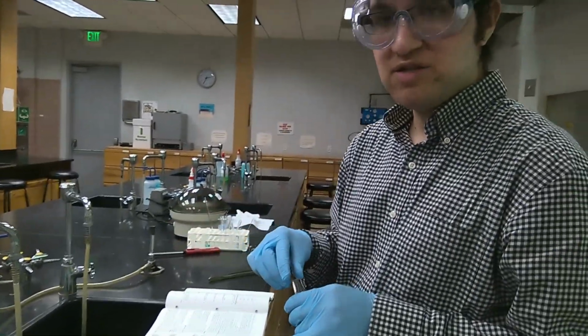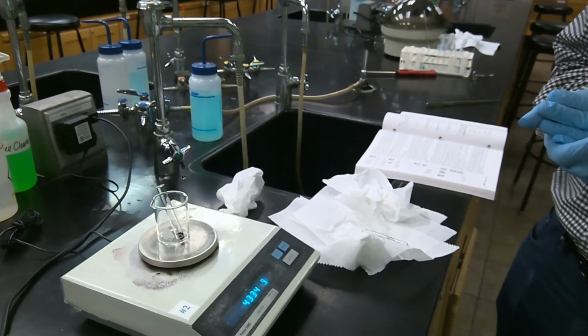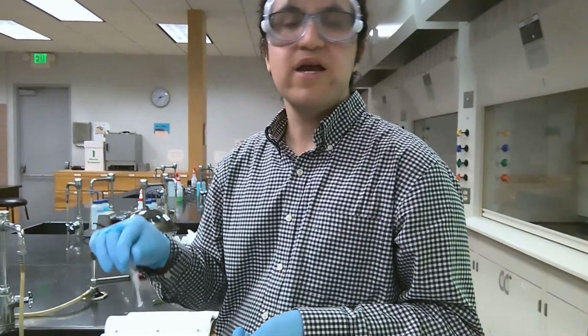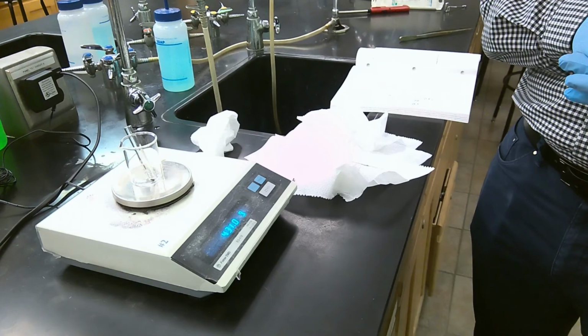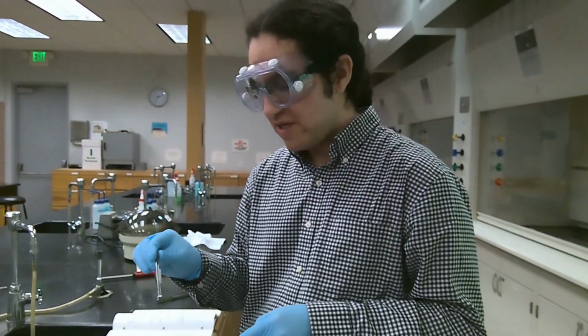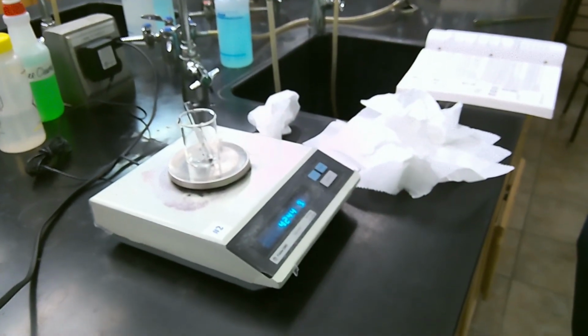Let's now weigh our test tubes. So first, let's weigh test tube 1. Okay, so let's now weigh test tube number 2. We finished drying our samples, so let's weigh our dried copper in test tube number 3.